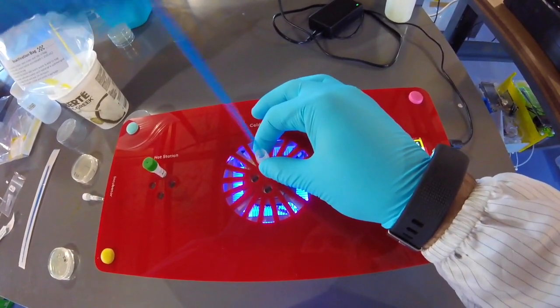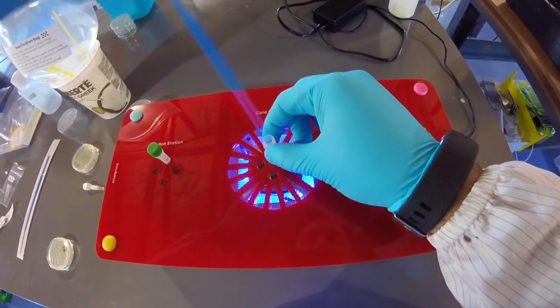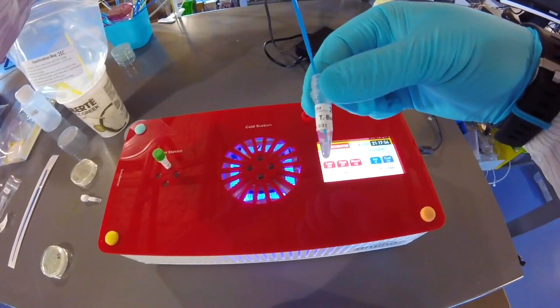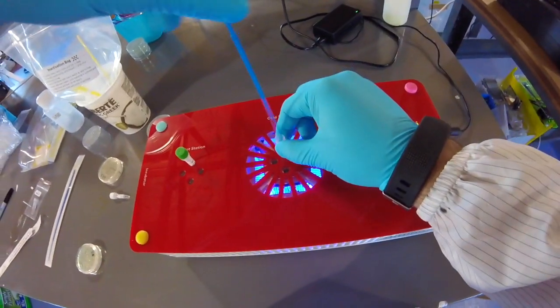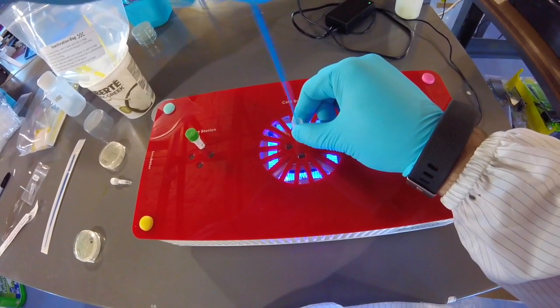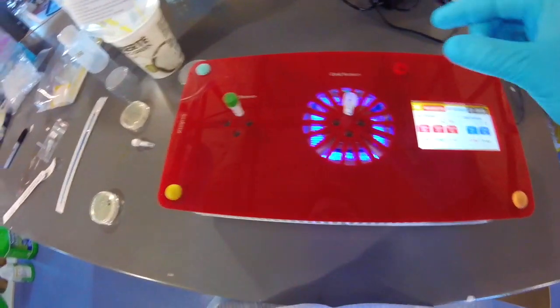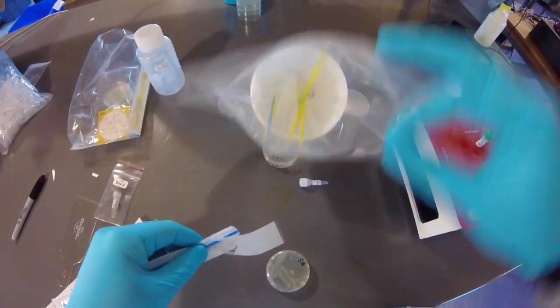The goal here is to have all of your cells suspended or nicely mixed in, and your solution should be cloudy. So if we look at it, it's definitely cloudy now, right? All right, so we don't want to wait too long. We want to do the next step as quickly as possible. So maybe mix for 10 seconds and move on to the next step. I just put my loop in the discard container.